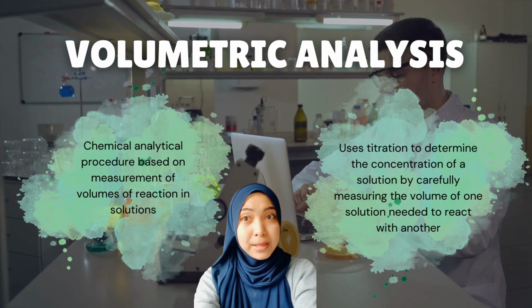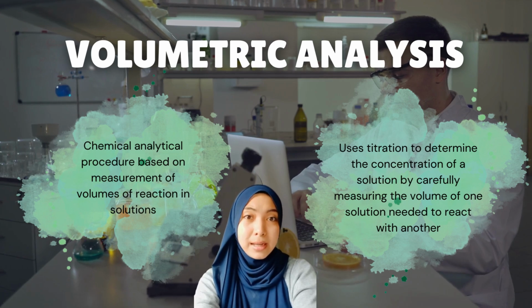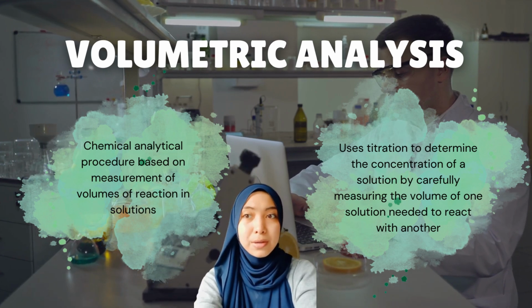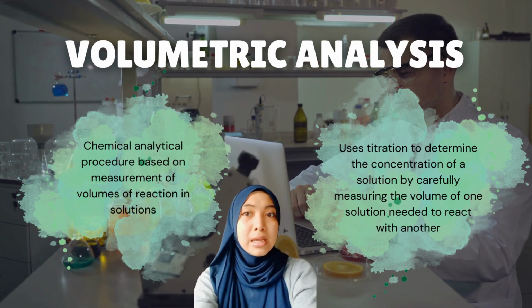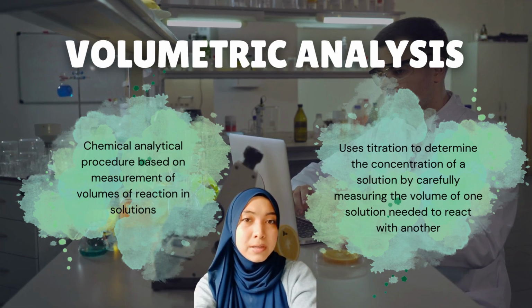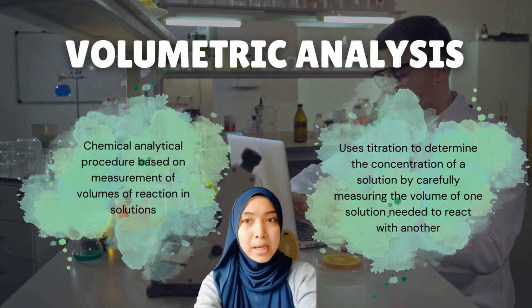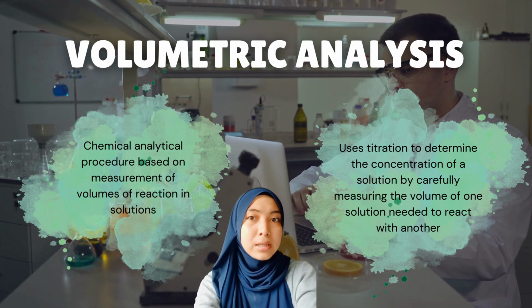What is volumetric analysis? Volumetric analysis is a chemical analytical procedure based on measurement of volumes of reactions in solutions. It uses titration to determine the concentration of a solution by carefully measuring the volume of one solution needed to react with another.